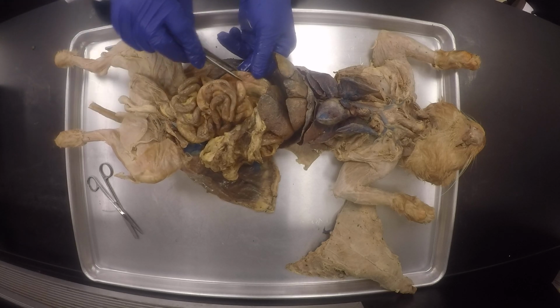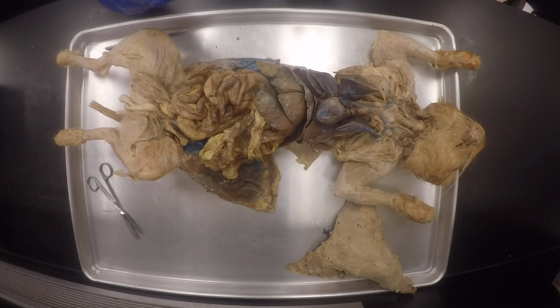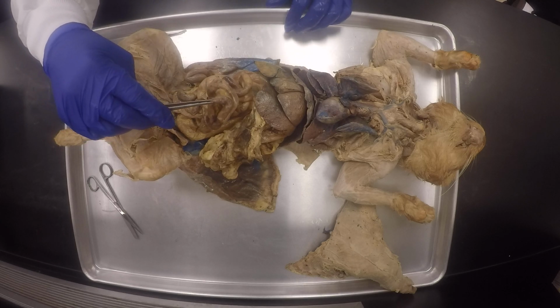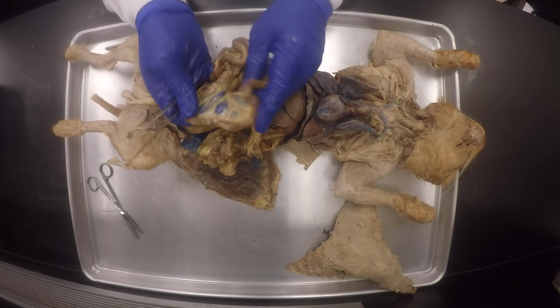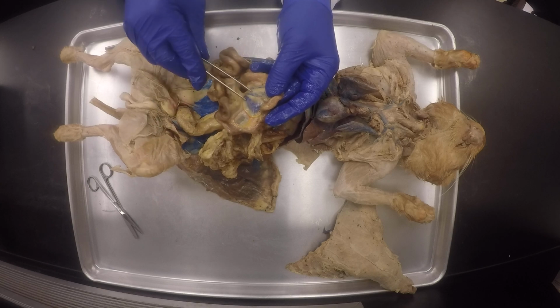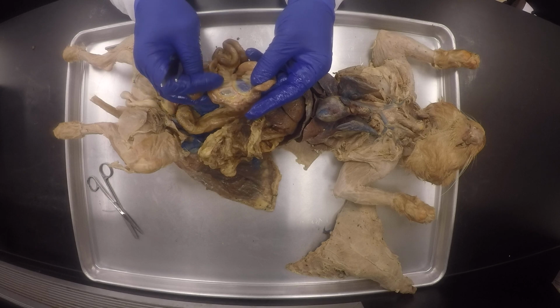Okay, so this is the duodenum, and then the duodenojejunal flexure, you won't be able to see it, but anywhere in the middle I point, you will be able to say jejunum. Okay, and this would be mesentery. That's what we called mesentery proper. You could see the yellow tagged portal system veins.